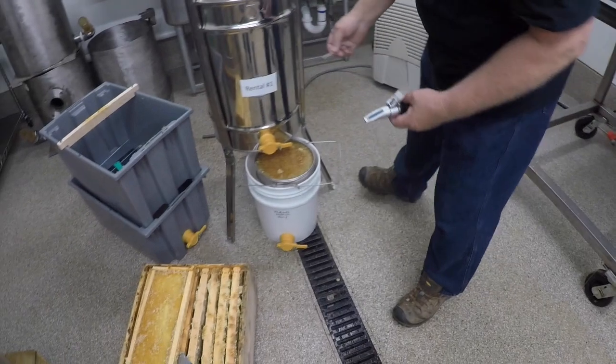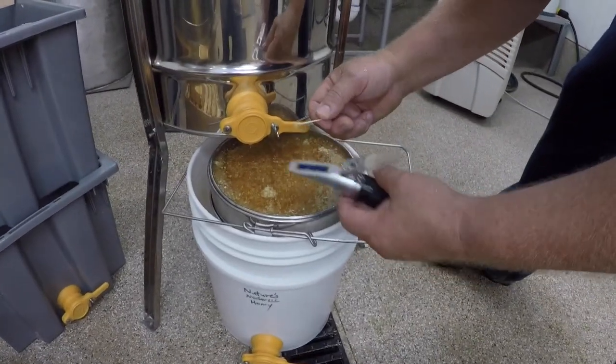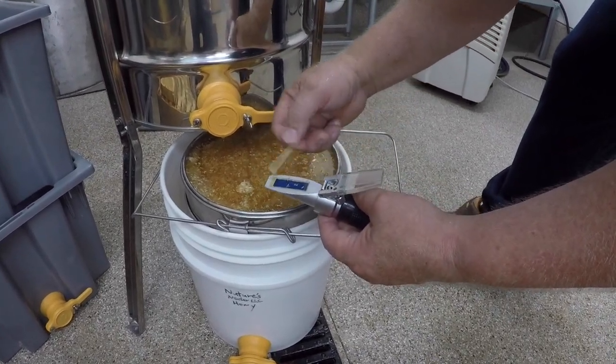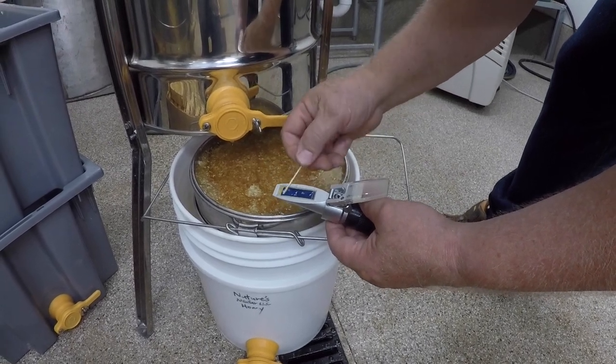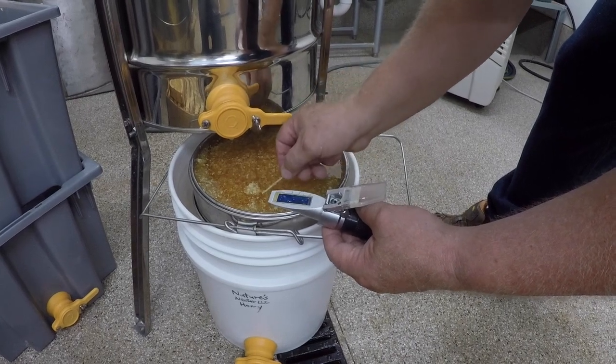So to do this, I just have a toothpick and I try to get it without any wax in it. Best we can do. And I just need a little bit. I can test anybody's honey if they bring me a sample. I test people's honey for free. Try to bring it to me without any beeswax.